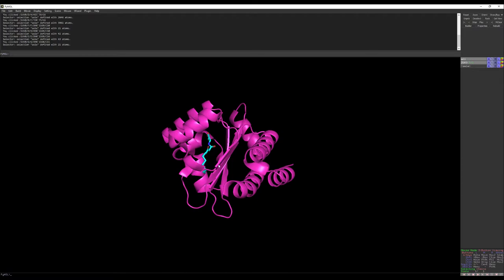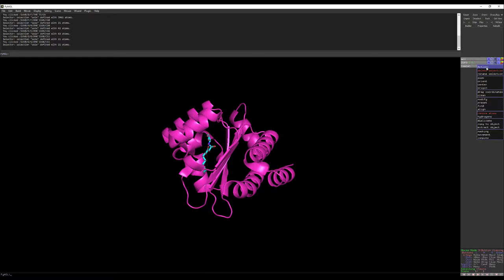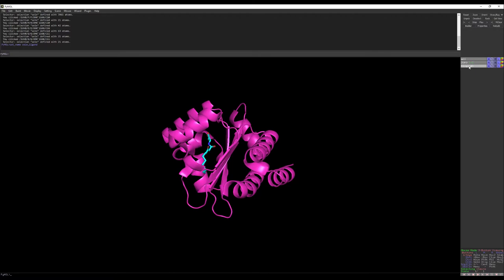Now I want to extract the information of the residues close to this ligand molecule. First, I need to select the ligand molecule. After selecting it, rename the selection — go to rename selection and change the name. I'm going to call it 'ligand molecule' and press enter. A new tab will open. It's important because when you use the command to extract residue information, you need to specify what is the ligand molecule you are referencing. That is why we extracted the ligand separately.